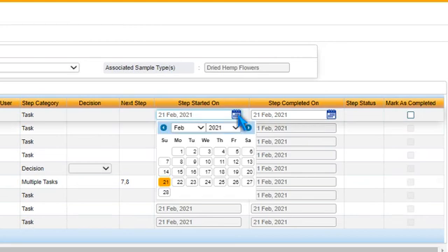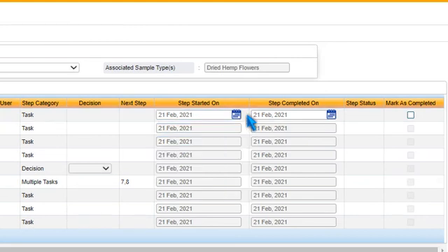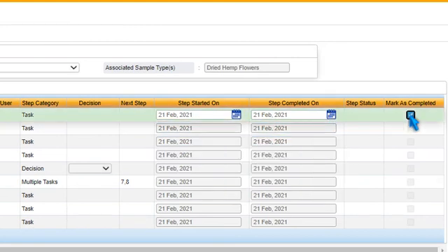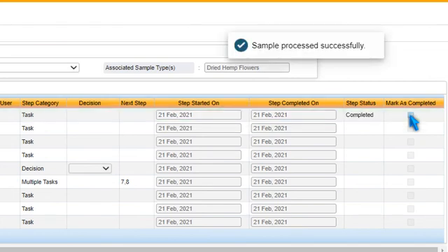Specify the start date, the completion date, and mark the status of each step. A technician can perform the step assigned to them only if the previous steps in the workflow, if any, are complete.